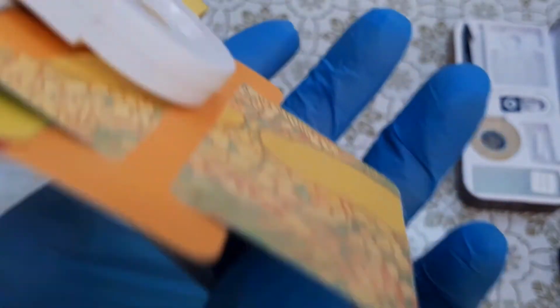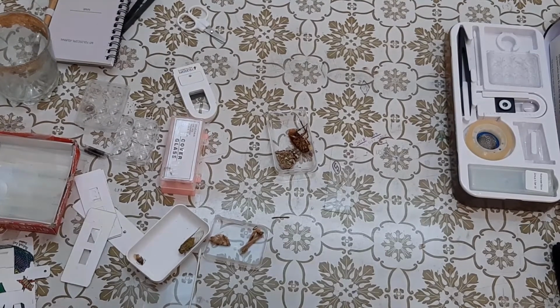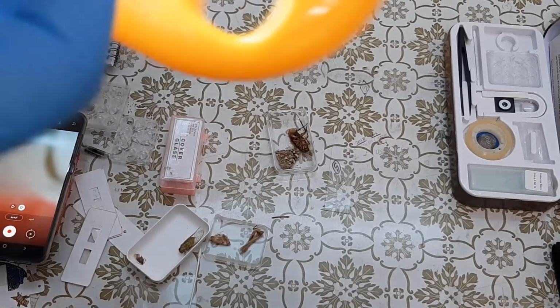So now I have been using the Foldscope LED, but I'm going to also try another form of light source, which is a portable light.